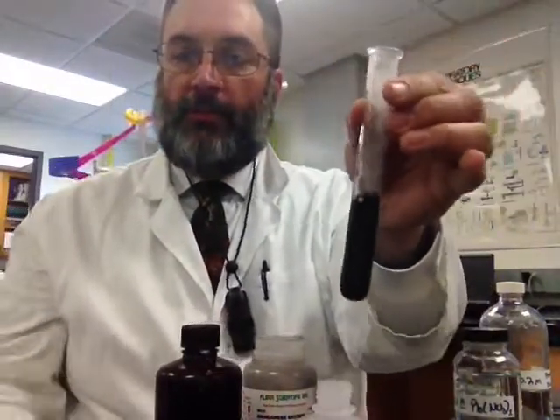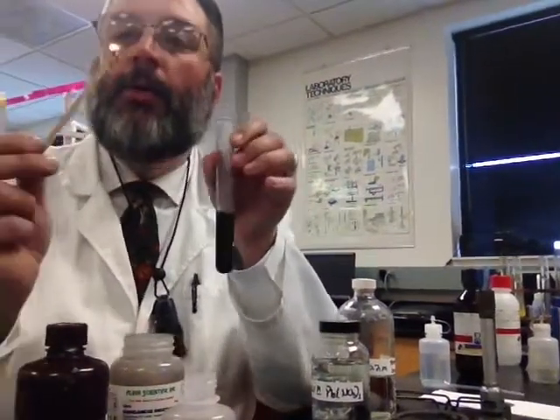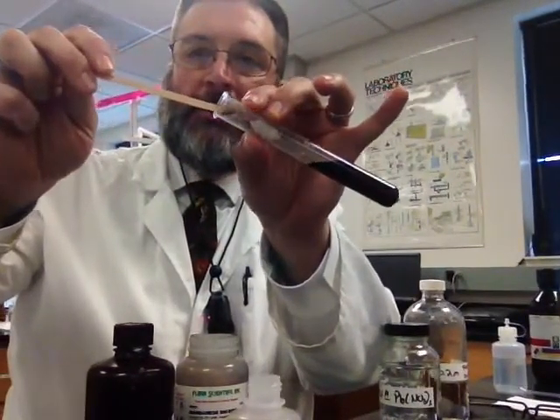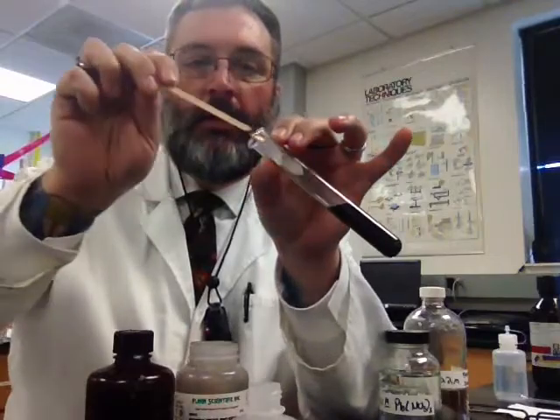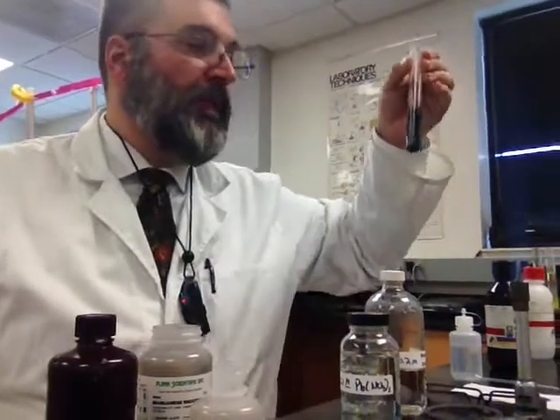Now if I want to test to prove that that's oxygen, I have another test because I know that oxygen is also flammable. So if I take a glowing splint and I put it inside, the oxygen causes it to light up again. See? Oxygen will cause a glowing splint to relight because it's flammable. Now, it doesn't pop quite as much as the hydrogen does because it's not that flammable, but it does cause a wooden splint to relight. So that's how you test for oxygen.